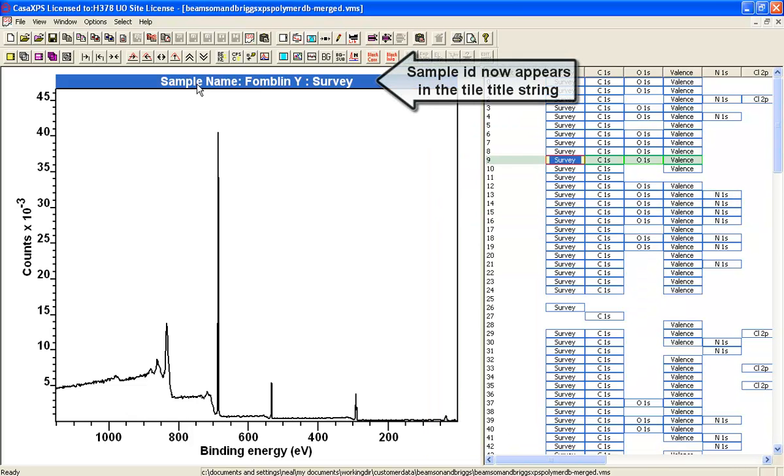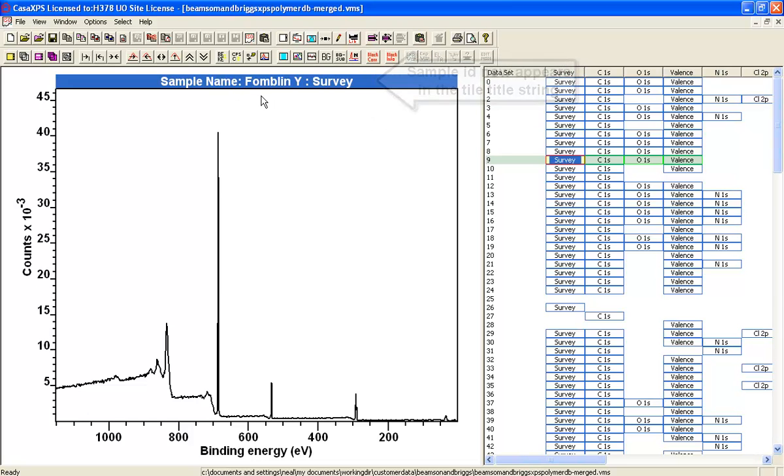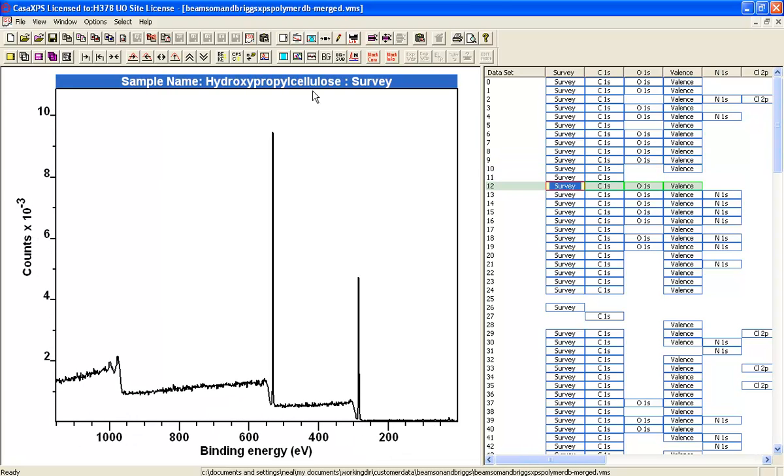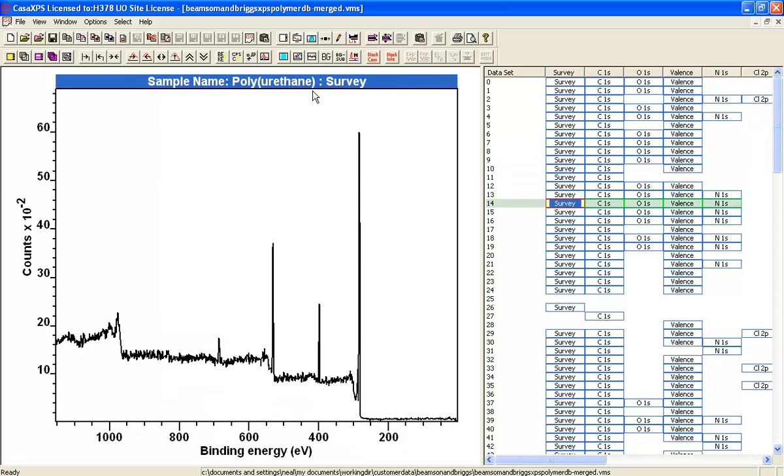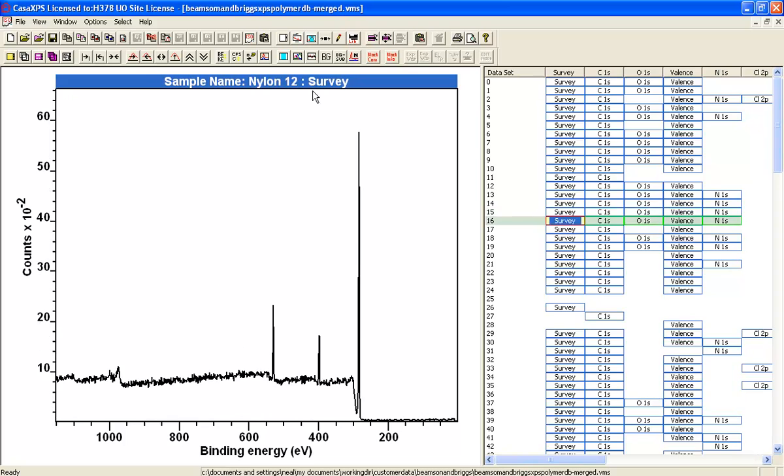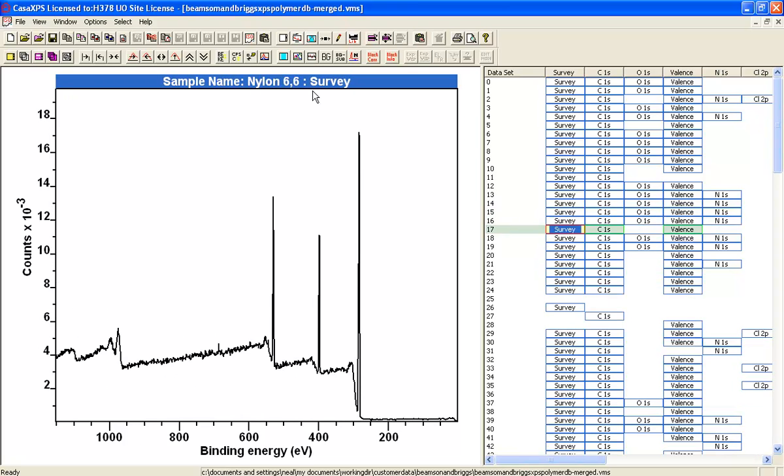When I select that option it displays the information that is held within the VAMAS block as part of the header about the sample ID. So as I scan down you can see each time the new spectrum is displayed.